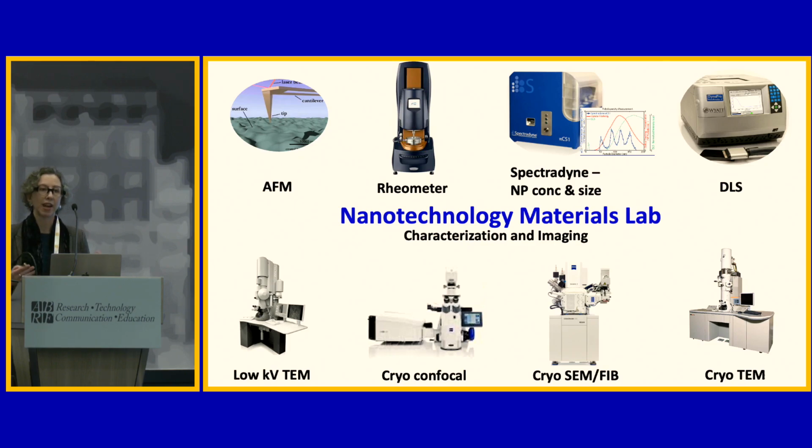And we are often asking biophysical type questions like, how big is something? What shape is something? How many have we made? How soft or squishy are these materials? Where are these materials located in the larger context of the research that they're in?